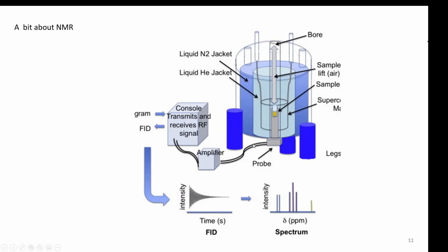And because that's a pulse, right? It's not a constant field, it's a pulse. So when that pulse disappeared, the internal magnetic field will gradually decay away. So we will have a free induction decay signal like that. So it's starting high and gradually decays. And if we do a Fourier transform of that data, that's a mathematical operation.